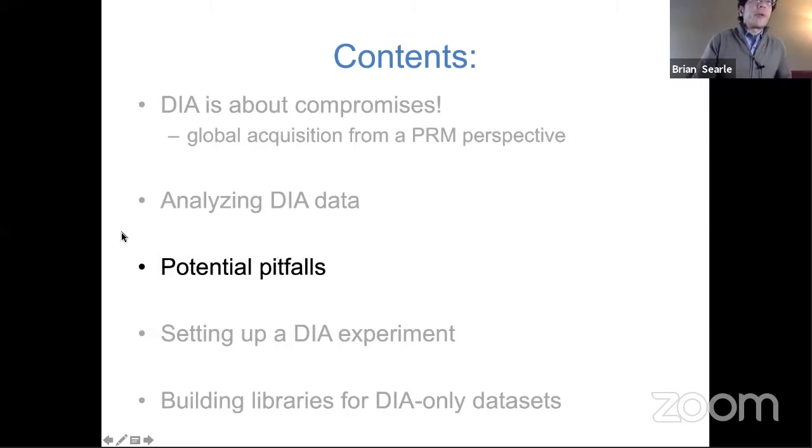Okay, so in terms of the difference between peptide-centric and spectrum-centric approaches, it's very subtle in terms of the explanation, but it actually is a pretty fundamental difference in how you think of these experiments. If you have a spectrum-centric approach, you take a selection of spectra, and each one of these can be at most 1 peptide. So we try to assign for each spectrum a particular peptide as a PSM. The number of times we ask a question is limited by the number of spectra we've got. So if we've got 50,000 spectra, then we only ask 50,000 questions.